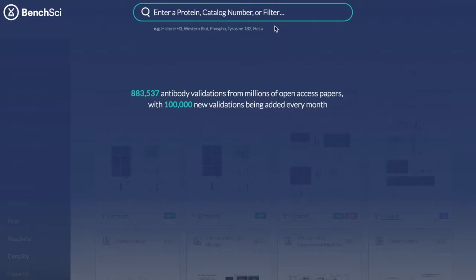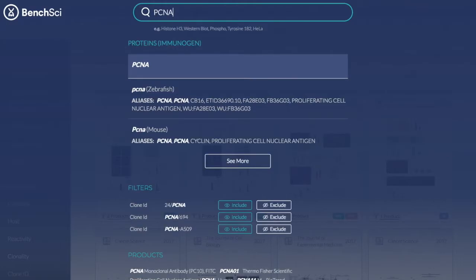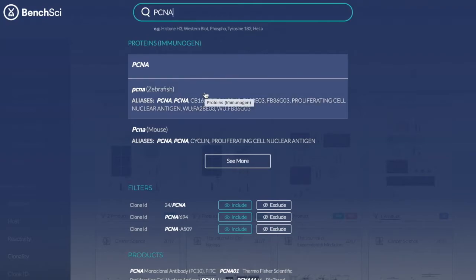To begin, simply click on the search bar. Here you can choose to enter a protein or gene name, for example, PCNA. In the drop-down you can select the generic term to see all results for PCNA, or select PCNA from a specific animal of origin as indicated in the brackets.